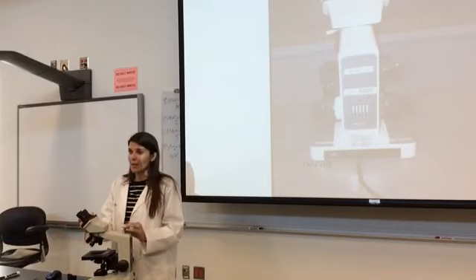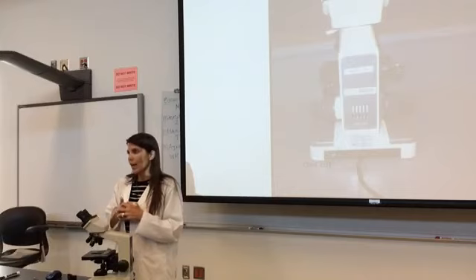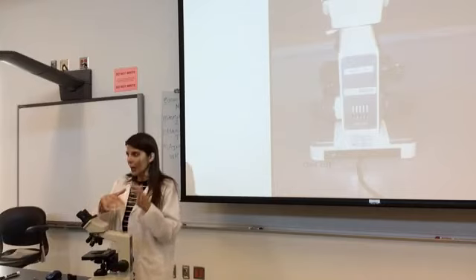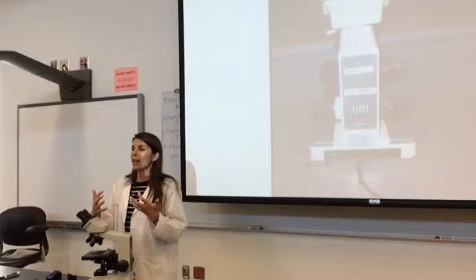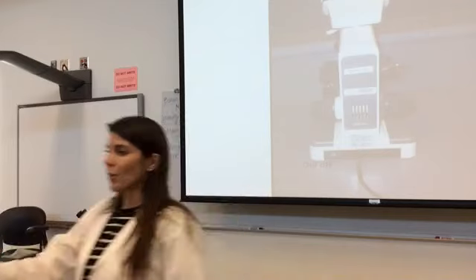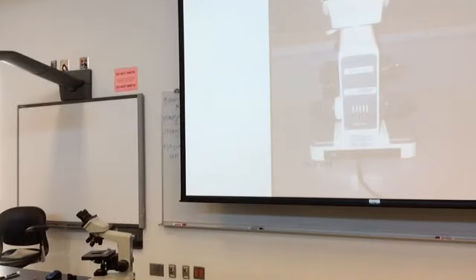You have 3 minutes to take your specimen and focus it correctly, and you get scored on that. So once I go through this today and we become familiar with it, my goal is that you become more comfortable.